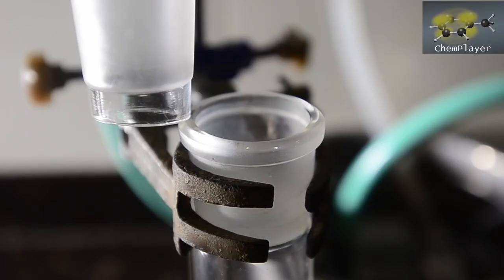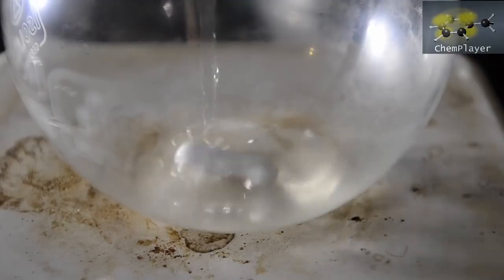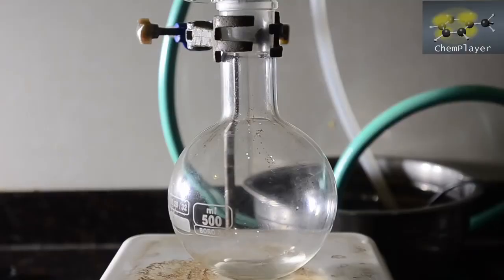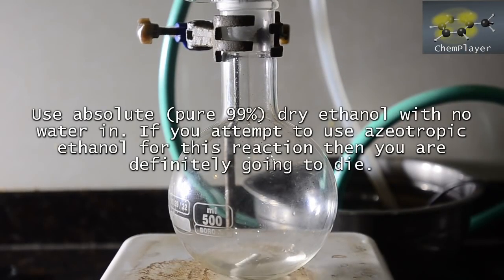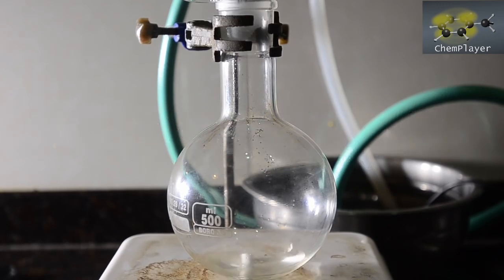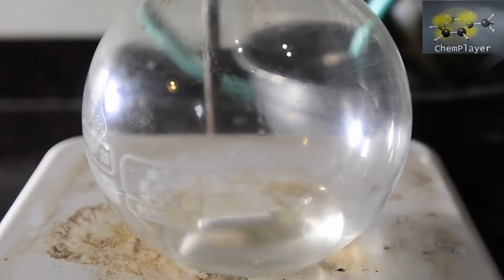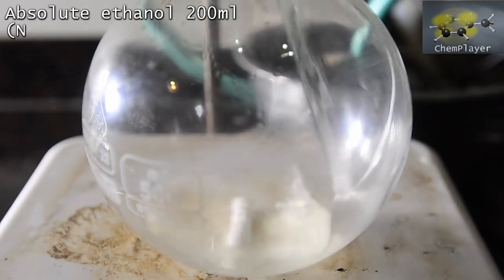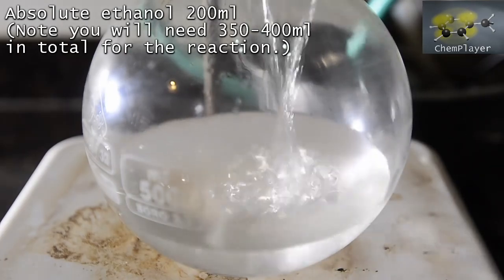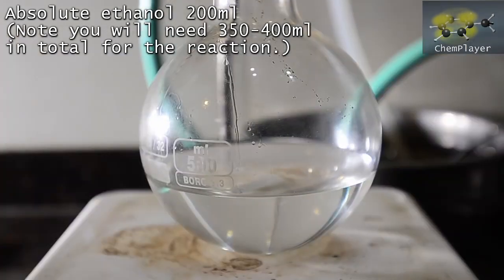First we add the 15 grams of pyridine to the flask. And now for our solvent and reactant, absolute ethanol. Note it must be completely water-free unless you like third-degree burns. We're going to start off with about 200 ml and see how we go. We'll add more as we need to. Note that you'll need about 350 ml of absolute ethanol in total.